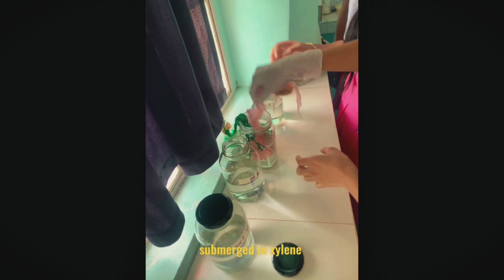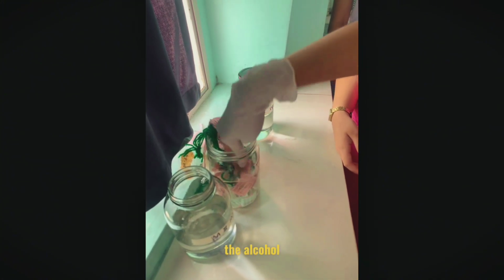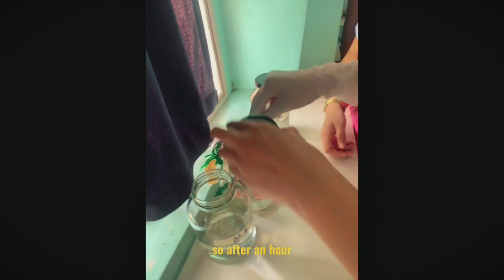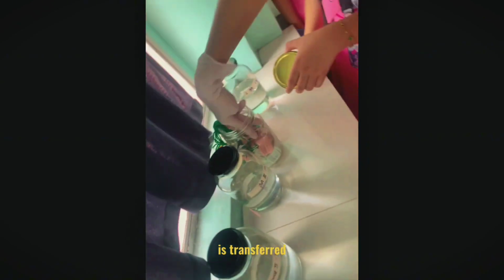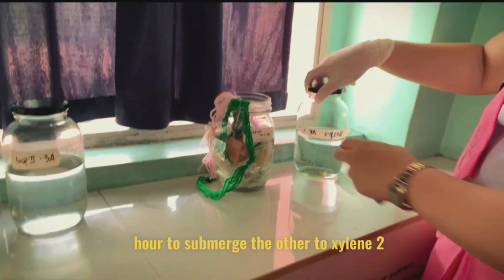First, the tissue is submerged in xylene 1. This is the xylene 1, submerged for 1 hour. This initial step helps to dissolve the alcohol and begin the clearing process. After an hour, the tissue is transferred to another. Now that the tissue has been submerged, let's wait for 1 hour for the xylene 2 clearing.